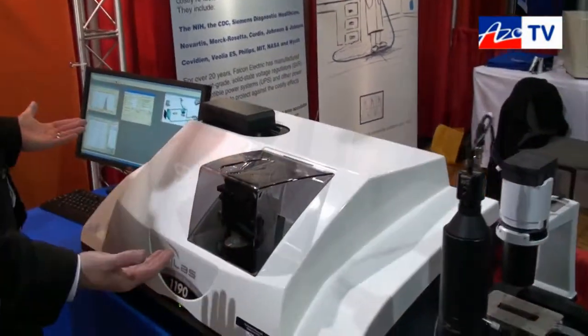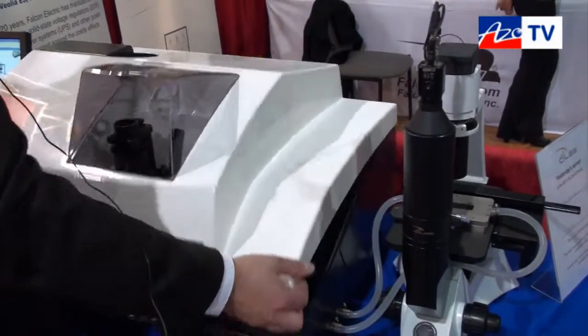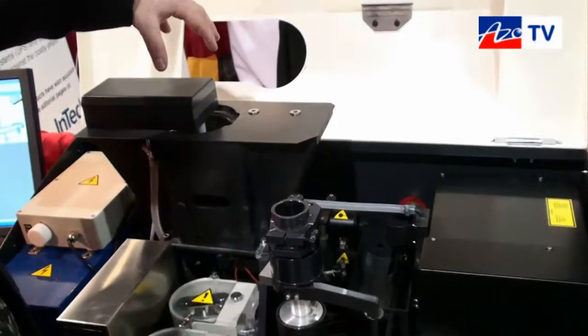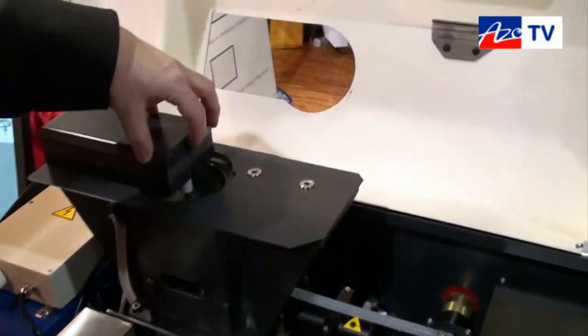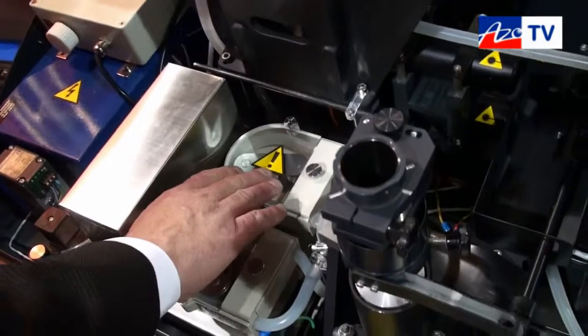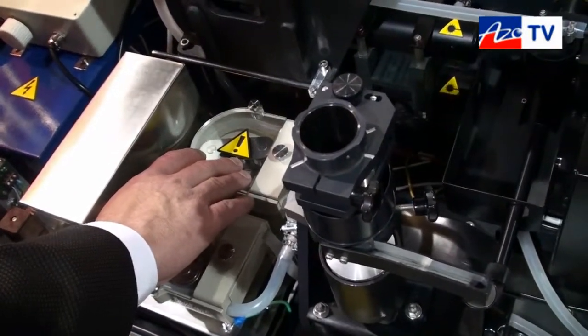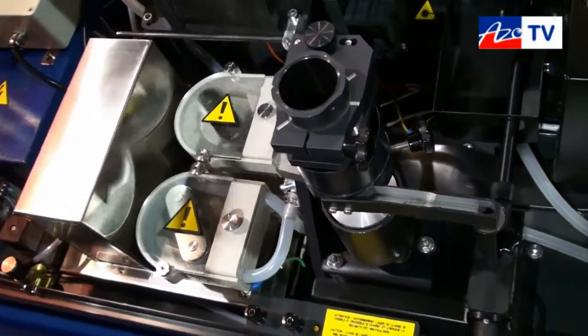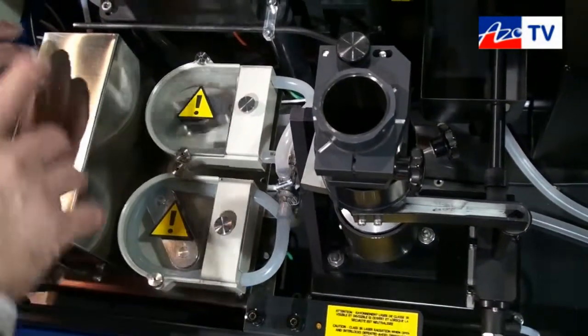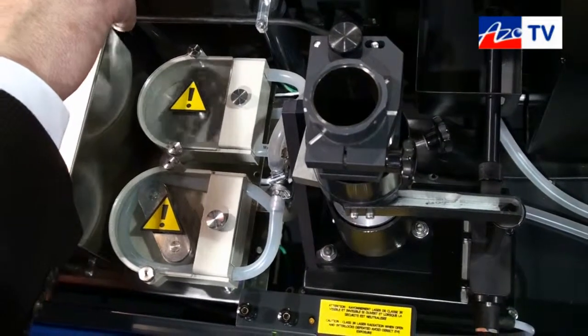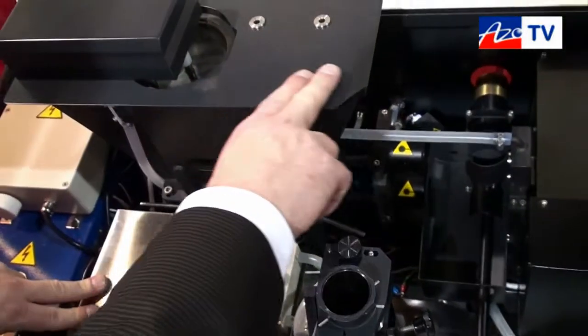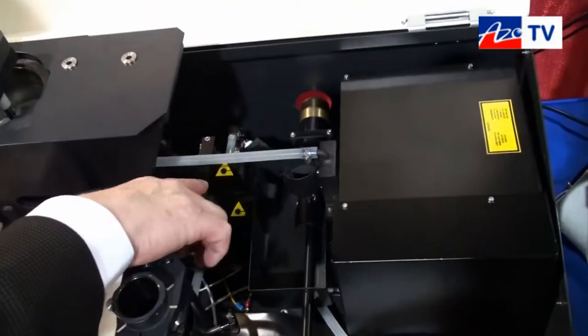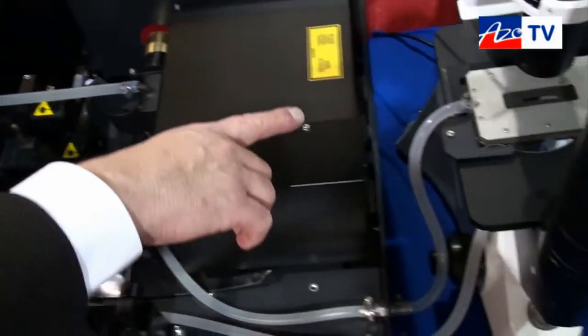To show you the instrument itself from the hardware, what we have done and CELAS has been on the forefront of this is we have an integrated liquid system with peristaltic pumps that enable the user to set the speeds depending upon the particle shape and the particle size and the results that they want to obtain. That path for the liquid dispersion takes you from the sample input through the cell where the optical cell is based and the multiple lasers through the imaging system.